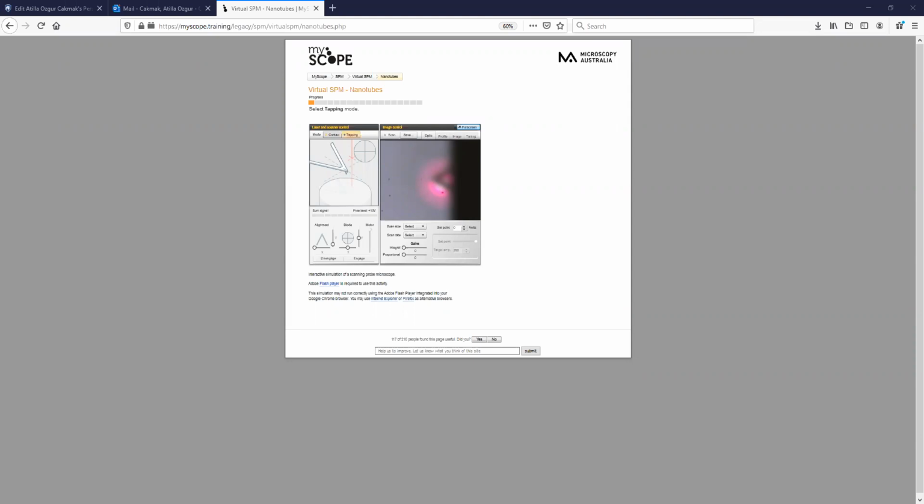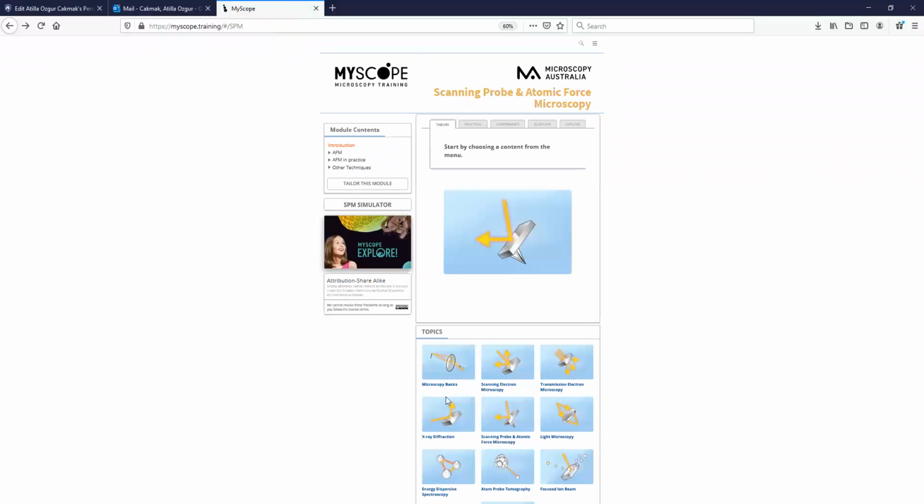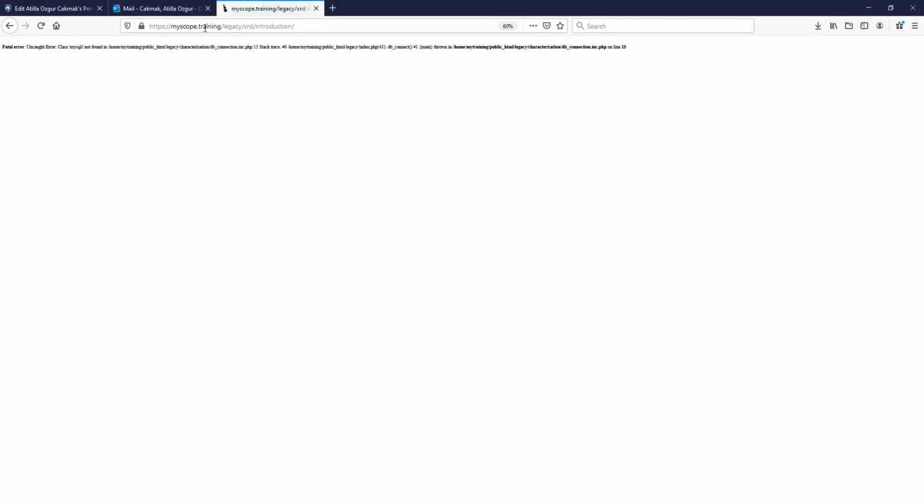All right, so one last thing I would like to talk about is the XRD simulator, the X-ray diffraction tool. Okay, let me pause the video here. Apparently something is going wrong.